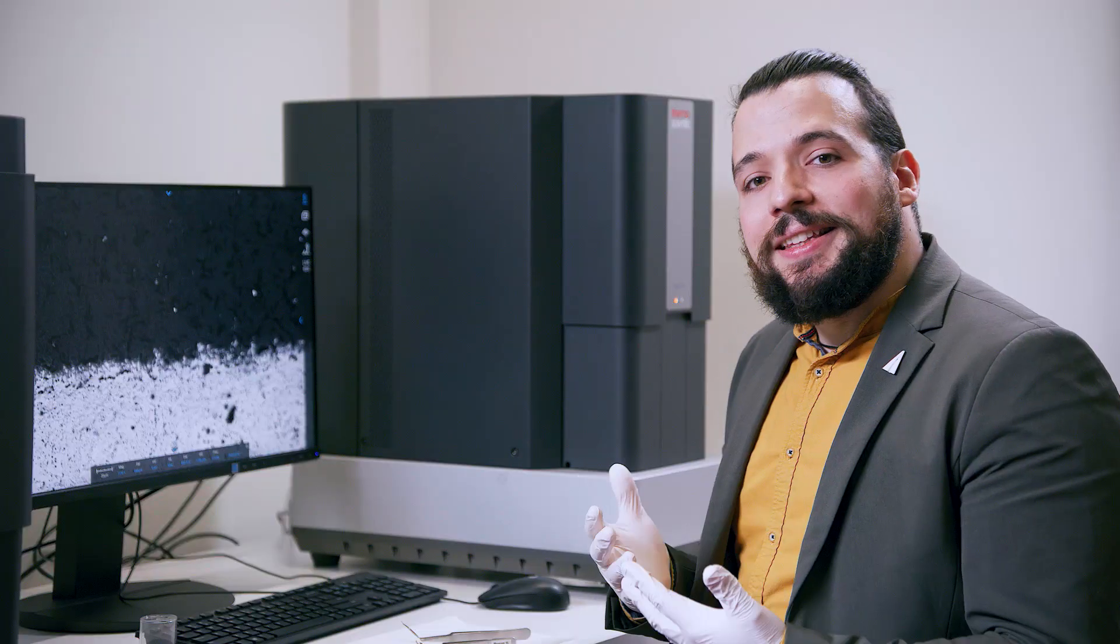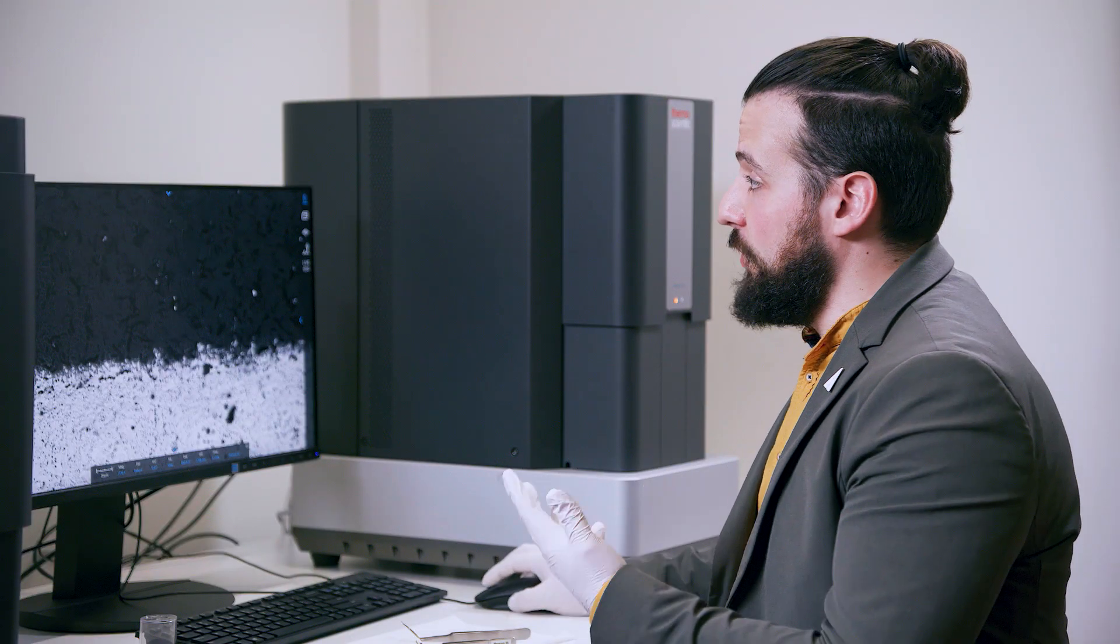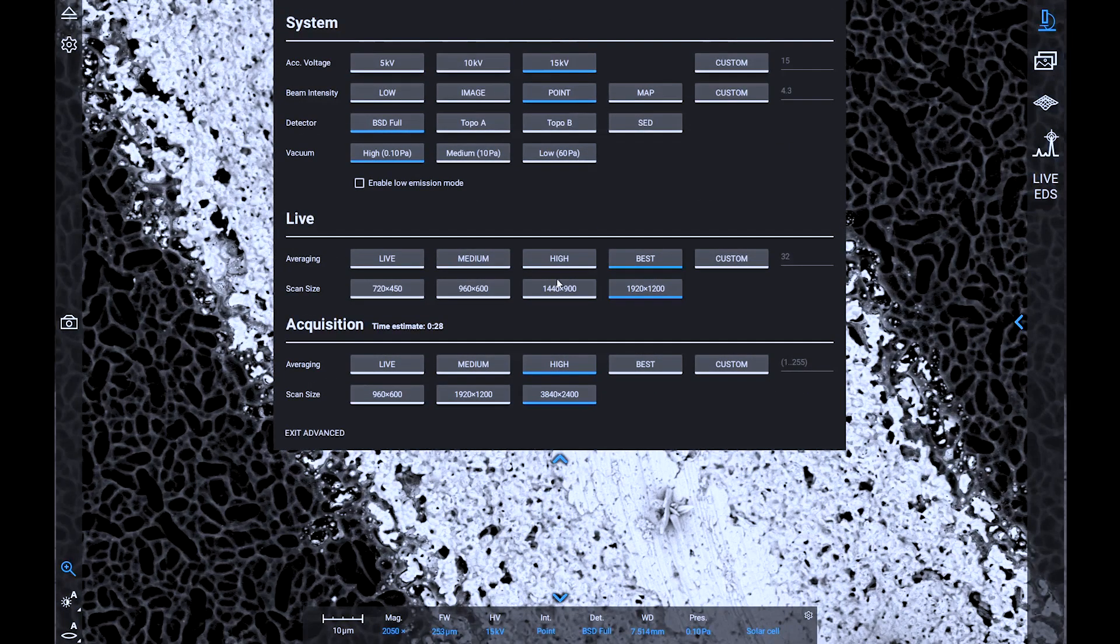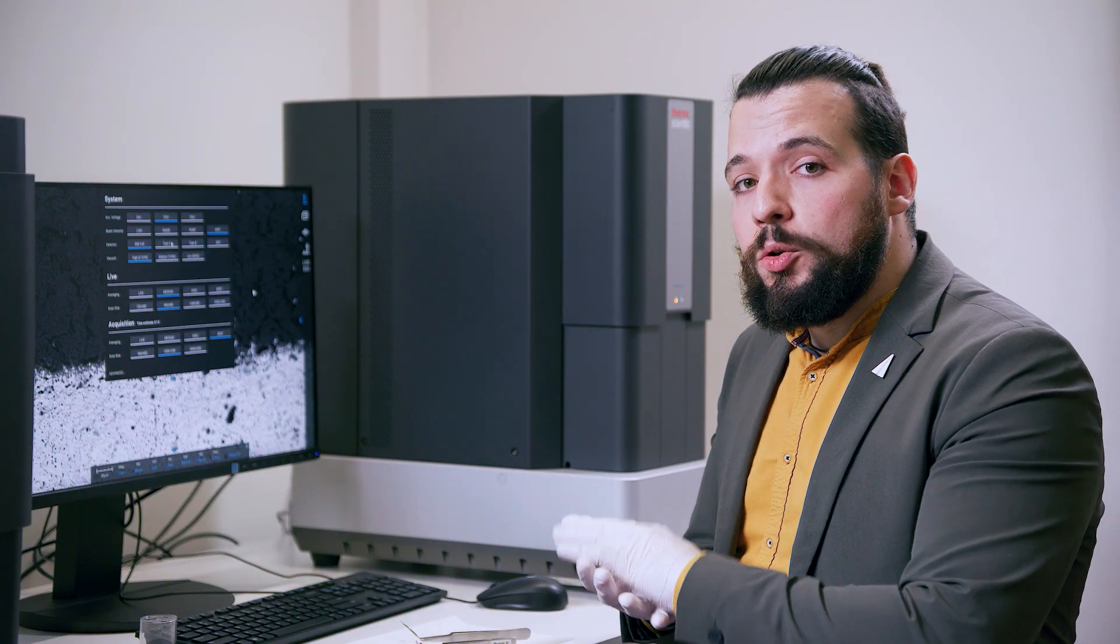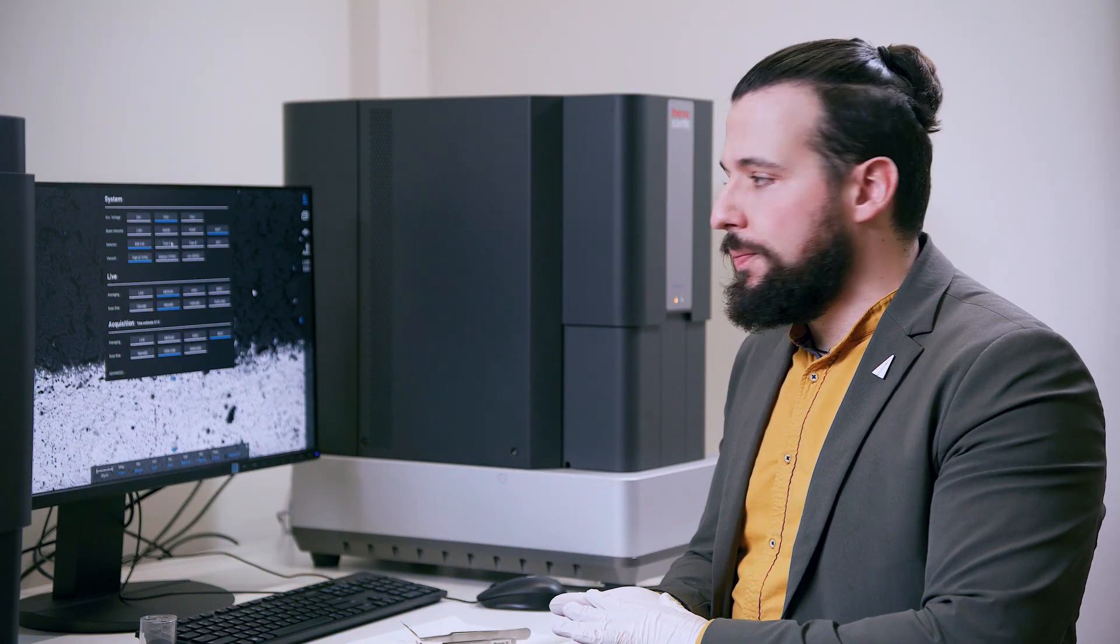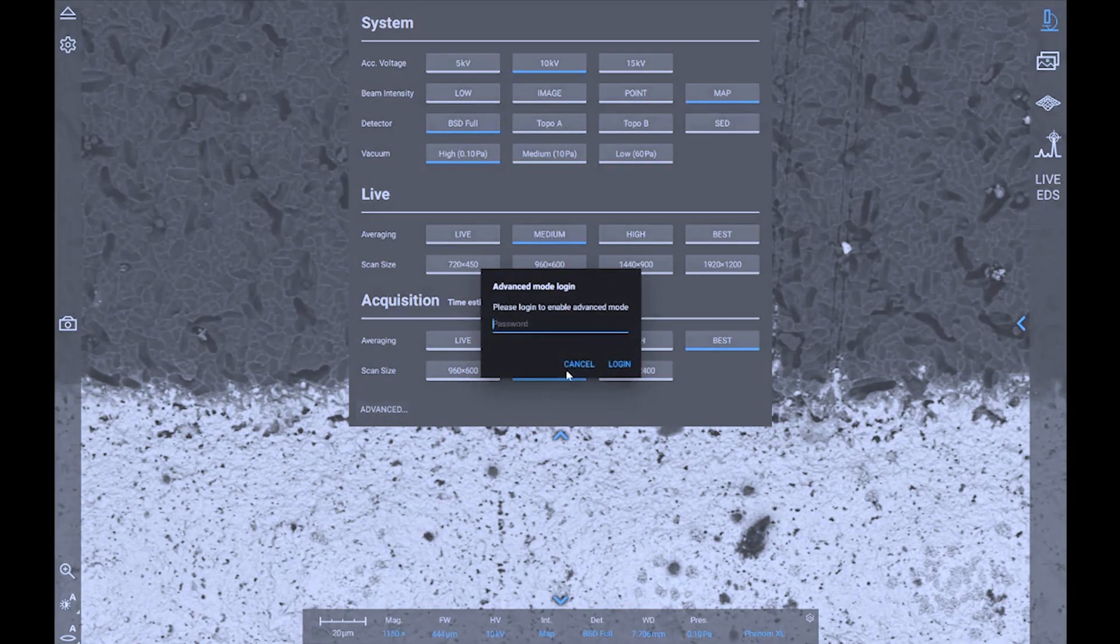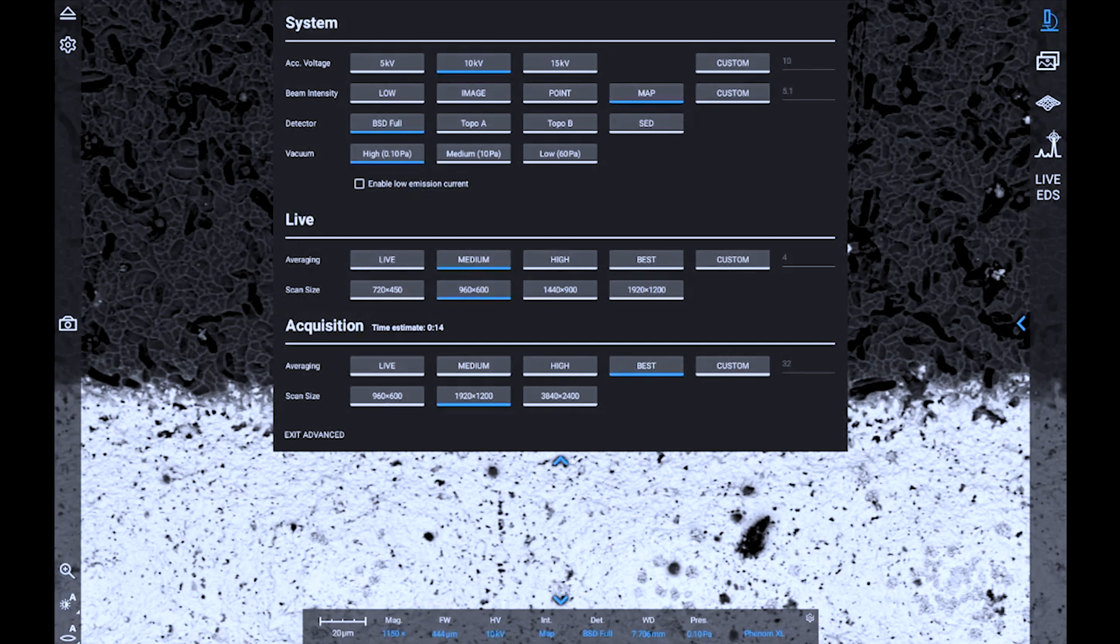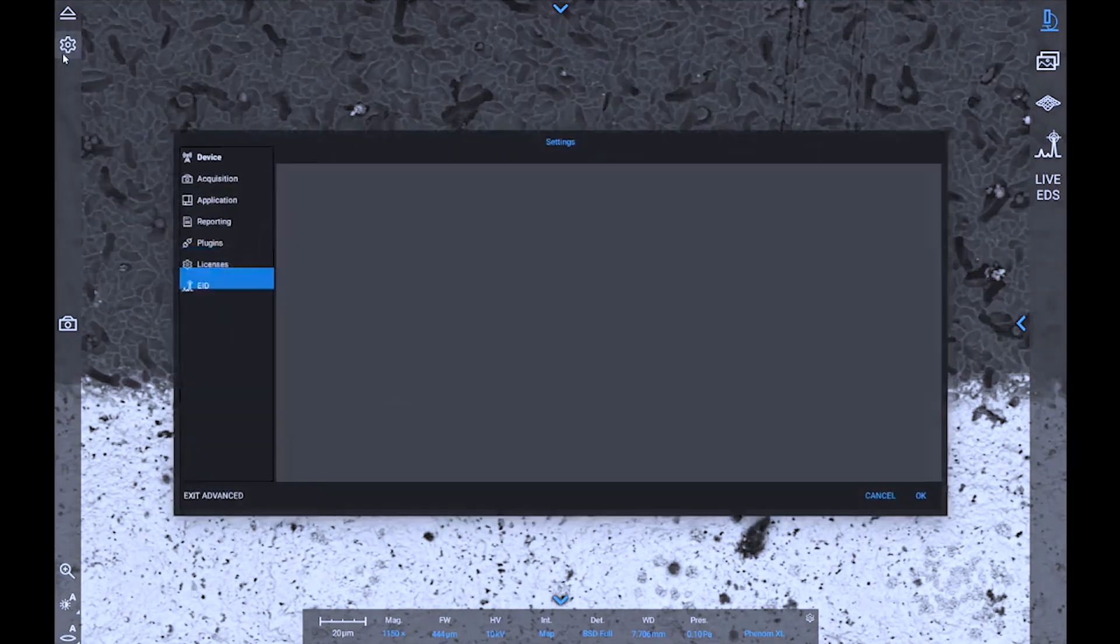More advanced settings can be accessed by the drop-down menu on the top part of the screen. Here we have a bit more control, for example, on the frame averaging or on the parameters that are used for the acquisition of the image. We also have an advanced menu that we can access with a password, where even more options are available, and the system can be further customized in the settings page.